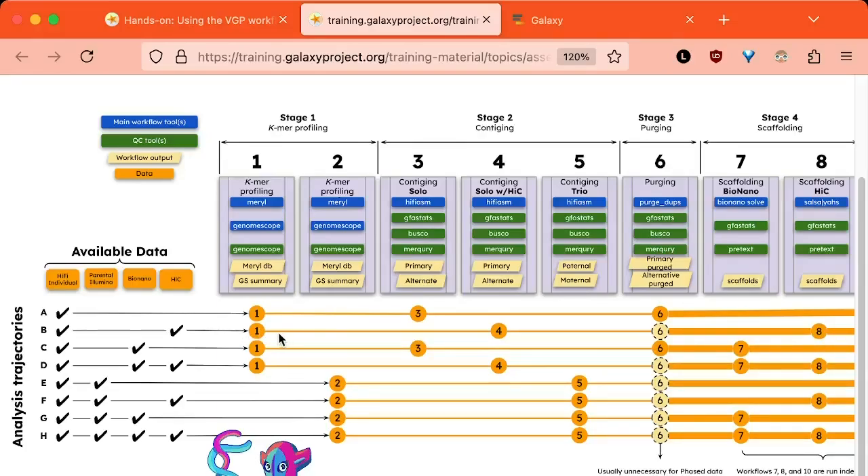In analysis terms, we start with a k-mer profiling workflow where we count the unique sequences in our sequencing reads and how often those unique sequences are seen. This builds an estimate of the genome lying in our sequencing reads to set expectations for the assembly, check for sample swaps, and assess the coverage of your HiFi reads.